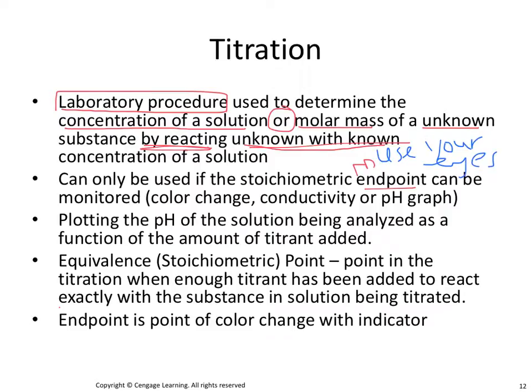Your eyeballs will tell you when the endpoint occurs, and the way you will know is because a color change occurs. That's with the lab procedure. Now you can use a pH graph and the equipment and it'll show you, but the big indicator is color change.